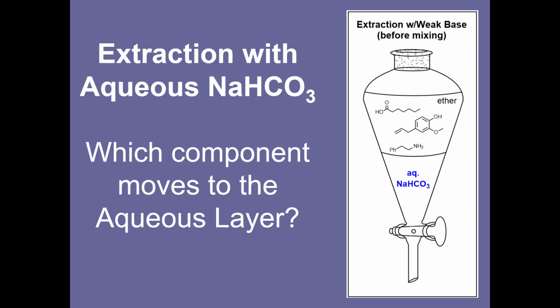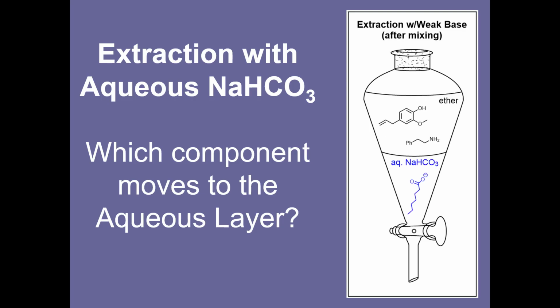Now, what if we had the same mixture of compounds, but instead treated the organic layer with aqueous sodium bicarbonate? Pause the video and predict whether or not any of these components would move to the aqueous layer. If you guessed that only the carboxylic acid would be extracted into the aqueous layer, you got it right.